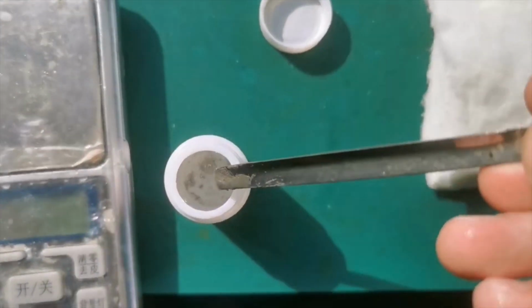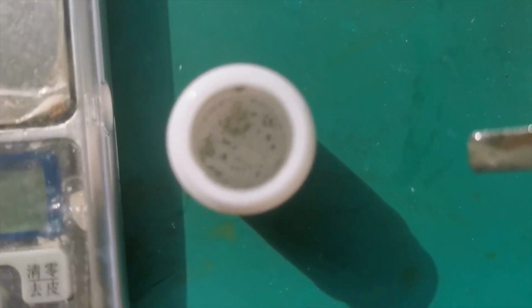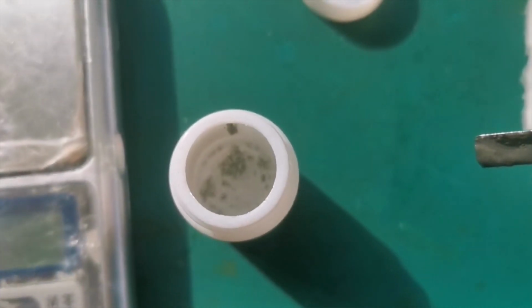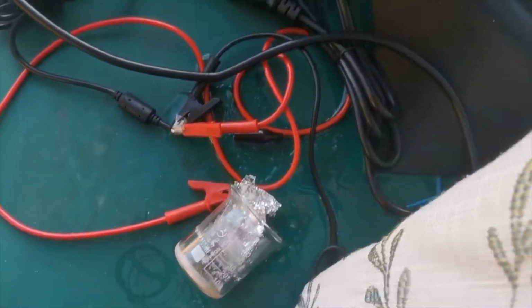It doesn't look like a lot, and it sure wasn't a lot, but this lithium is truly made at room temperature and without any really expensive or exotic reagents. Also, around 1 hour after I harvested, the cell was blown down by the raging wind and my raging curtain, and I lost nearly all of my precious electrolyte. This made the 0.2 grams of lithium even more precious to me.